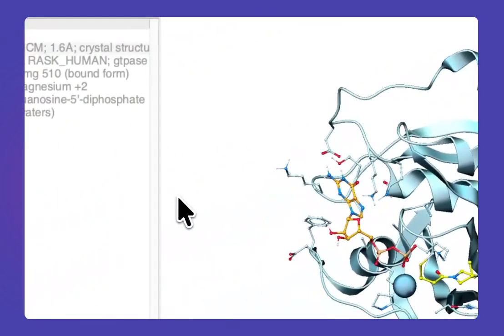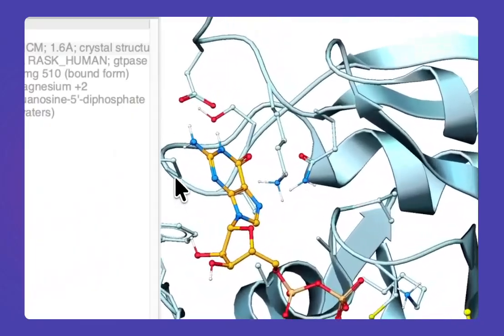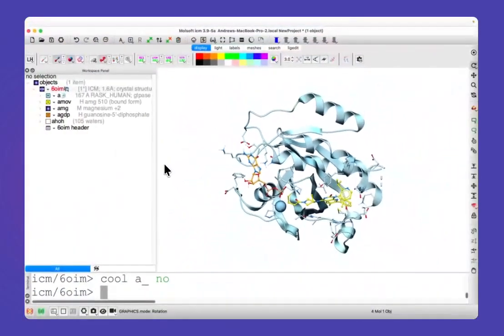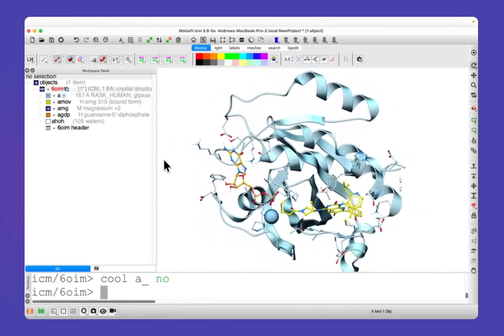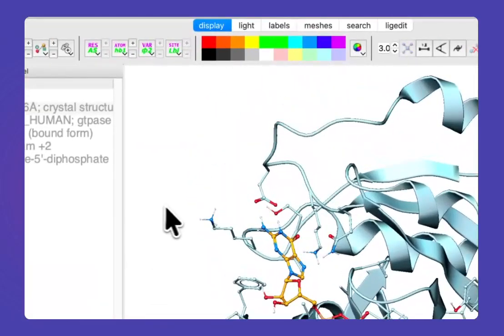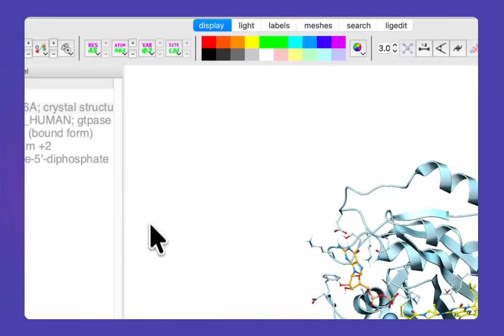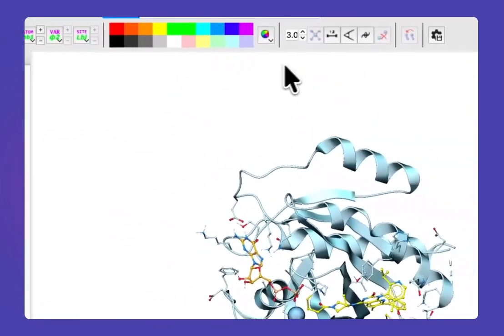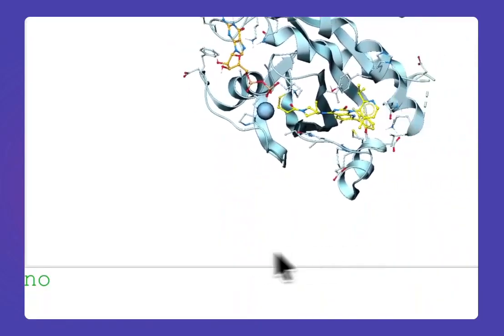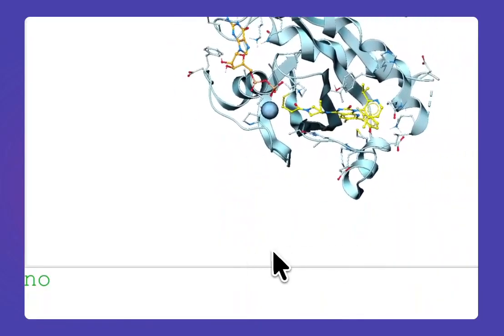So click here, and then use the defined regions on the side of the graphics panel, just using your left mouse button. If I go from cursor to zoom, you can zoom in and out on this side. The top is devoted to Z rotation, the bottom is devoted to movement, translating it across the screen.